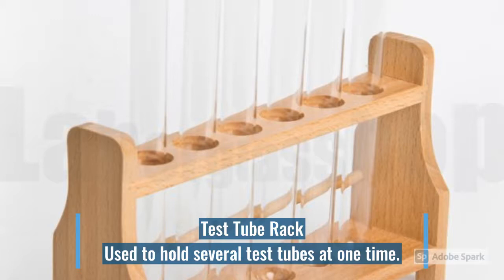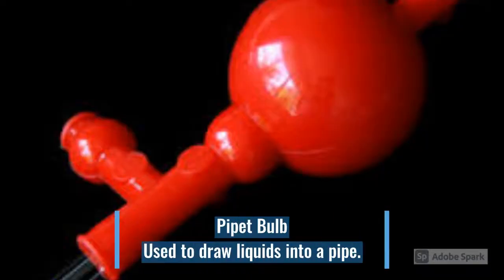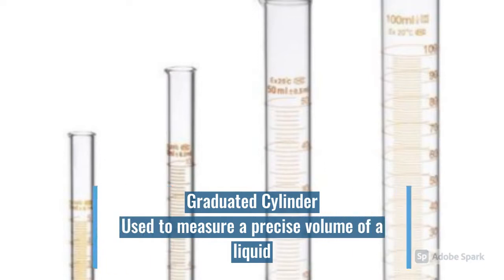Test tube rack, which is used to hold several test tubes. We have a pipette bulb. This one mostly is for drawing liquids. Graduated cylinder for measuring precise volume of a liquid.